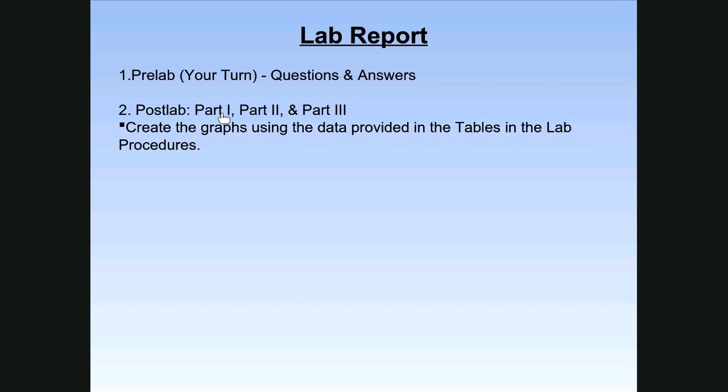So when you give me answers about what concentration of substrate the enzyme prefers, what concentration of substrate the enzyme is most active at, make sure you also cite that slope value. It's got a numerical value. It's going to be a similar pattern for part 2.